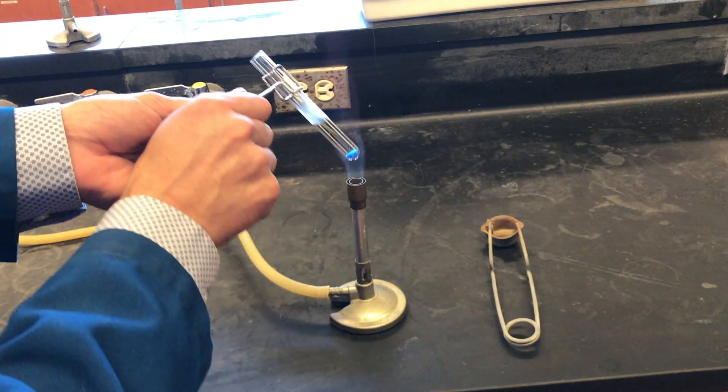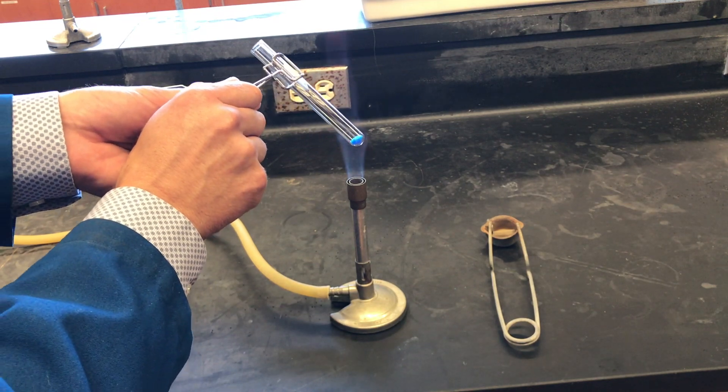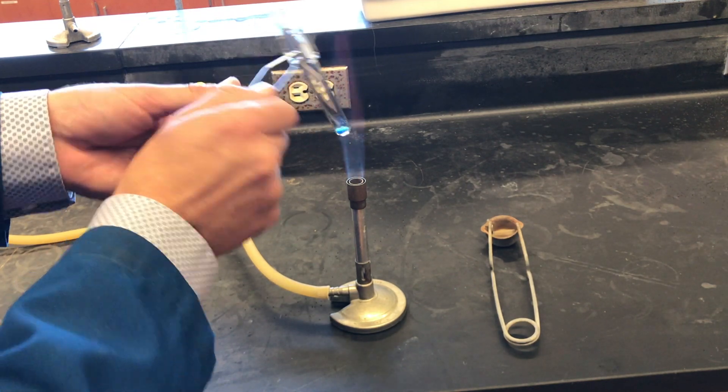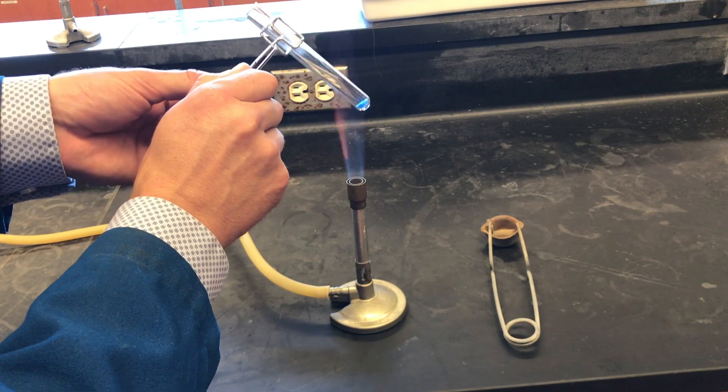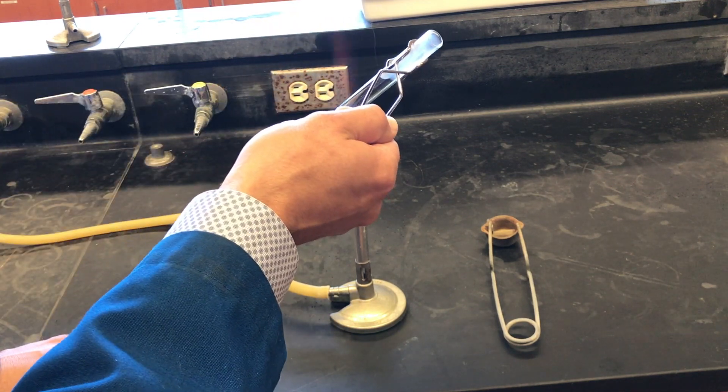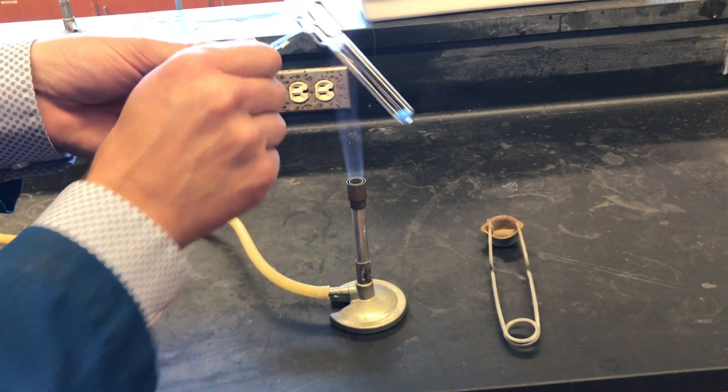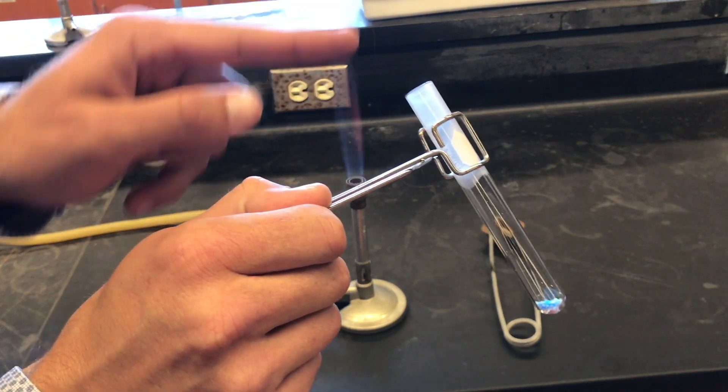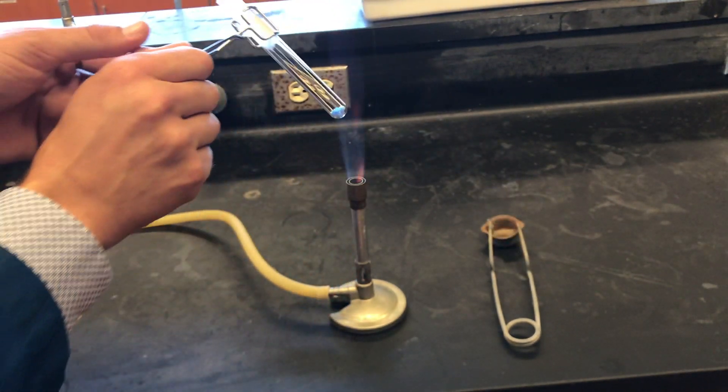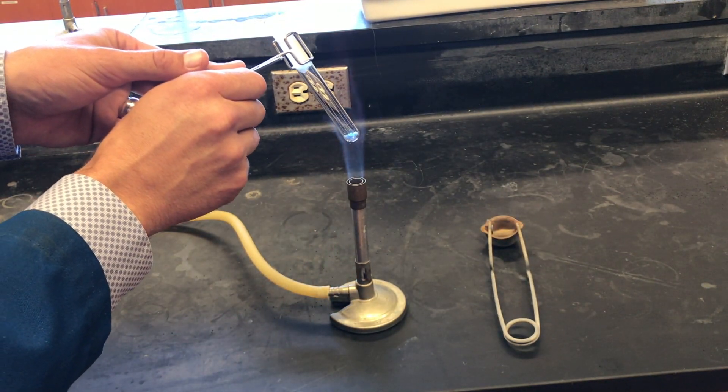We're going to heat our material in the test tube, holding it at a 45 degree angle and making sure that the open end is not pointed towards anybody, including ourselves. We can see liquid starting to form at the top of the test tube as we continue to heat it.